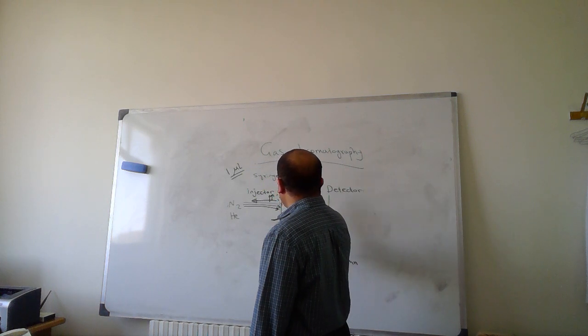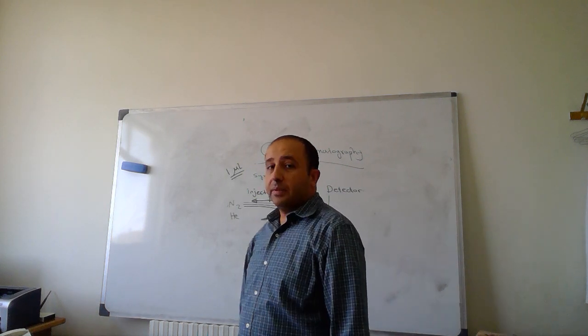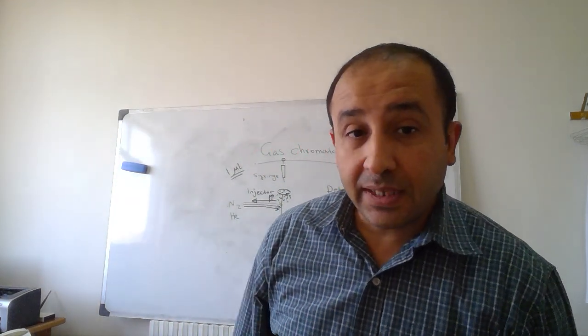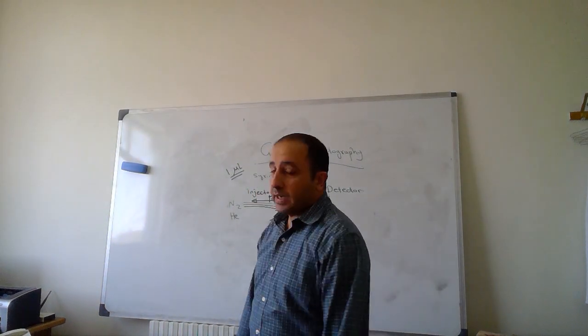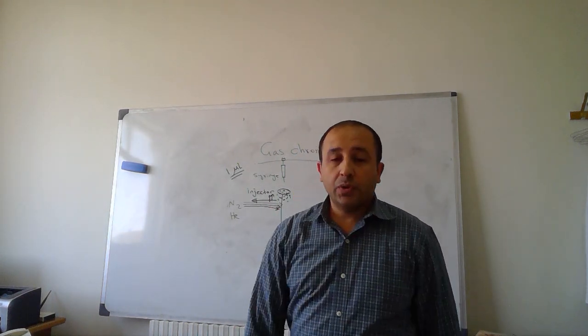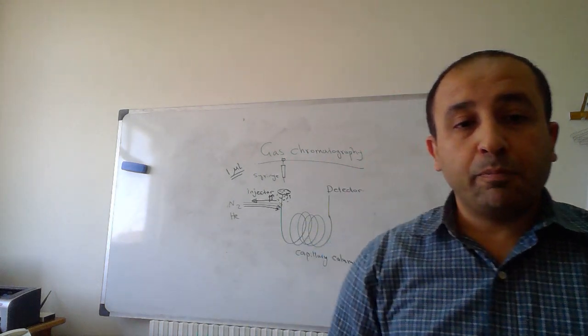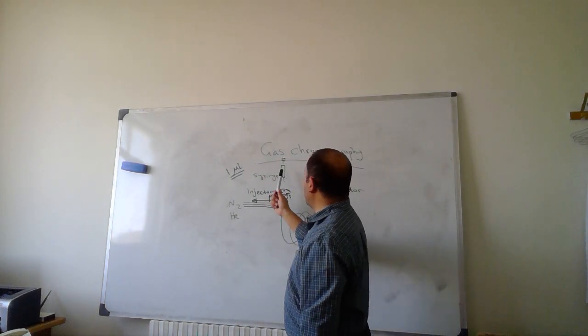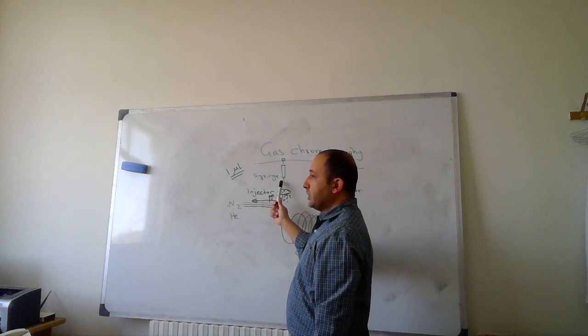And you know that the solvent molecules are abundant molecules, and they contribute significantly to the pressure inside the injector. So, as we said, in order to reduce the chance of backflash, we have to reduce the quantity of the injected sample.